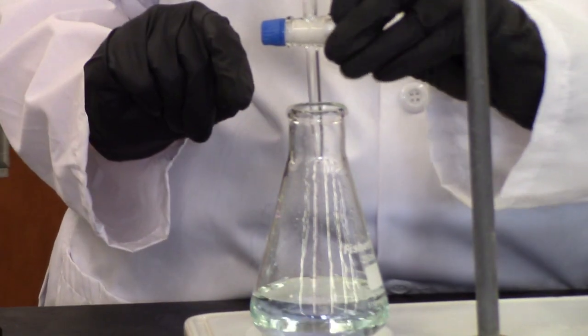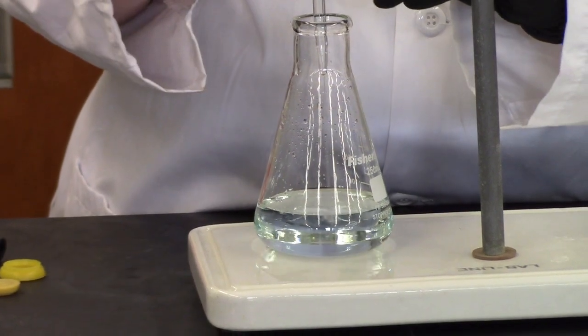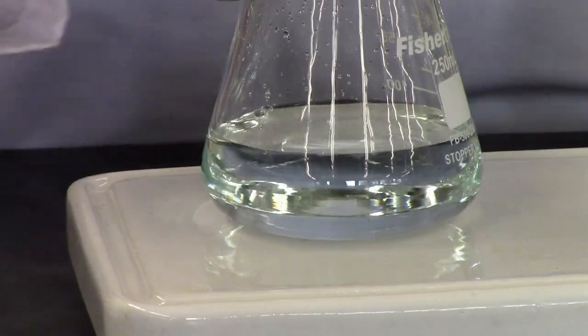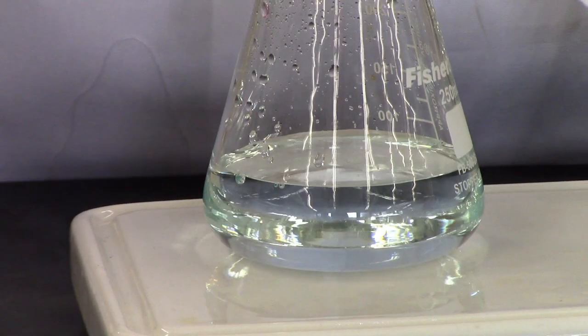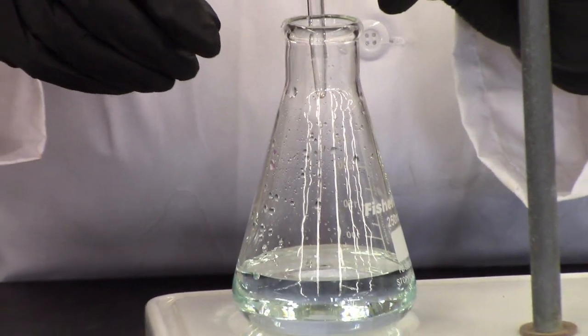Oh, so zoom in on this. Can you see the pink cloud that just forms? Watch when I put the base in, and then when it mixes, it goes away. See it? That's a hint that I'm close. So this is the stage where I kind of slow down a little bit. I'm not gonna just let it pour in anymore. You can actually go a drop at a time, like this, if you control your valve carefully, okay?